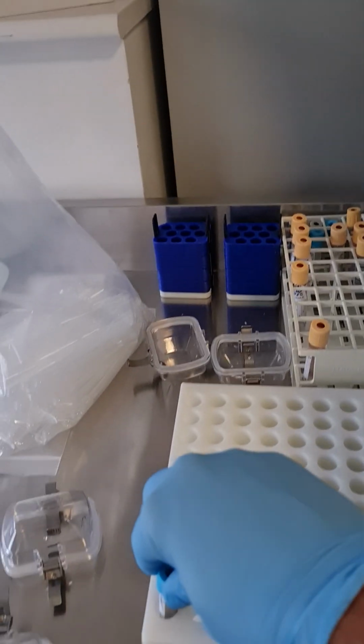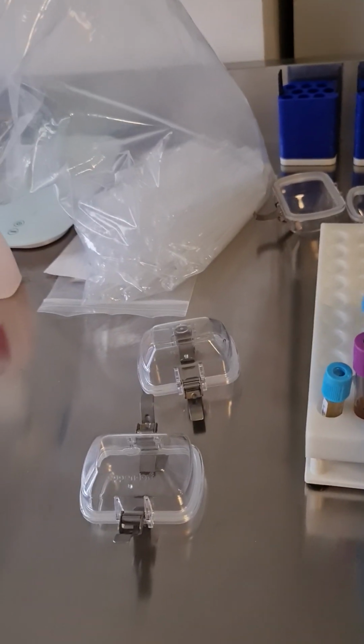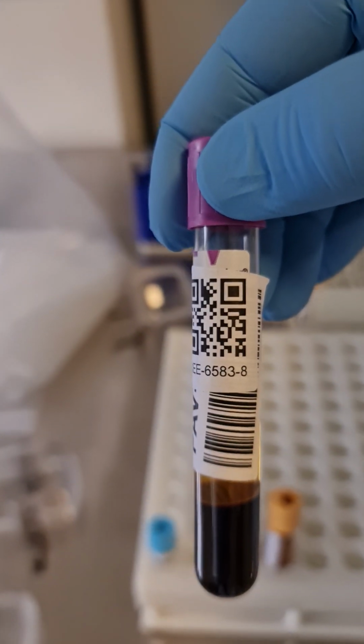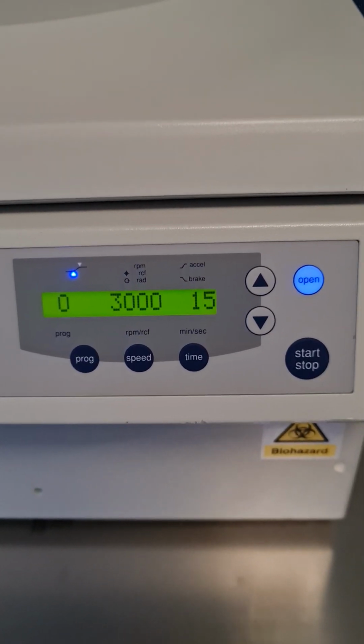Put the sample back in the holders. And if we have more than one sample, it follows in sequential order. So the next number would be CEE 6584 and so on. Spinning cycle completed. Just open the centrifuge.